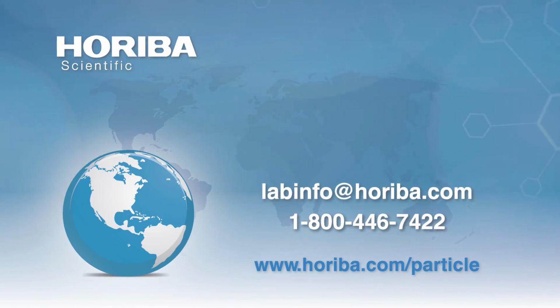Okay, great. And when coating beads with IR and ER drug layers, what are the most critical parameters to consider? That's a great question, and it's an extensive question that would take quite a bit more time to go into than we probably have here today. But I would always recommend determining throughout the development process what those critical process parameters are. I did mention on one slide what the process parameters were for the Surerelease coating that we used in the case study. Here at Colorcon, we try to determine what those critical process parameters are for our clients before we provide a coating solution to them based on their needs.